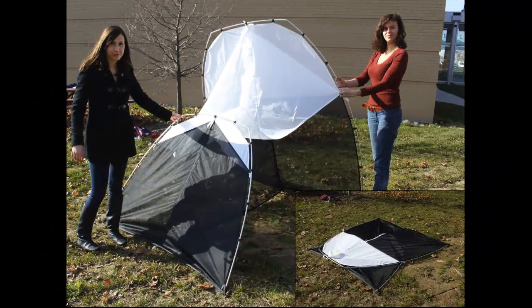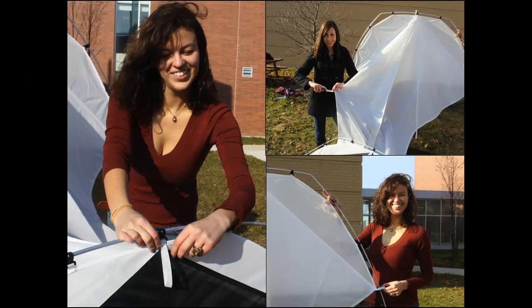The trap should now be secure to the ground, but you will notice that both the front and back ends are still flopping over. Ropes will now be secured to the trap and anchored to the ground. There are a series of rope loops along the edge of the trap.